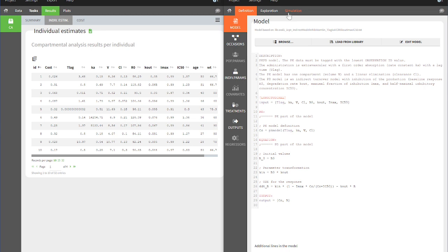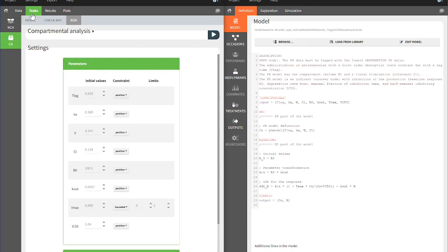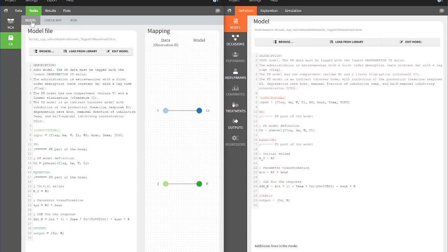The Model section of the Definition tab contains the structural PK-PD model that has been selected for the analysis in PK-Analyx.